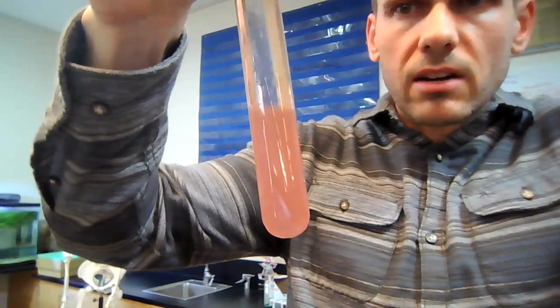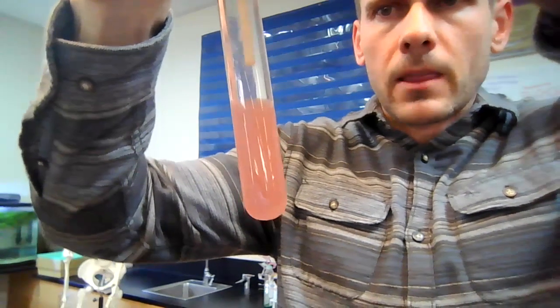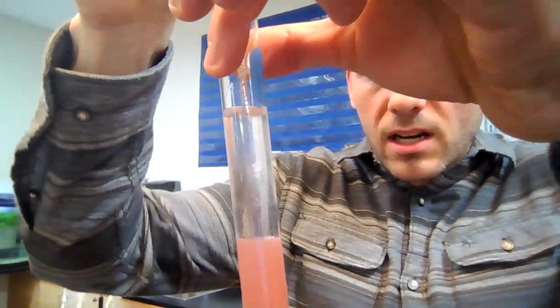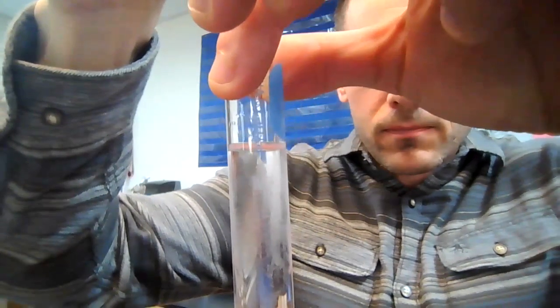You have to look really carefully. It kind of looks like little bubbles or snot almost. If you pull it up, you might even see it come out a little bit. See that? I think it looks like snot. Pretty gross. Maybe that's what's been in your nose all these days.